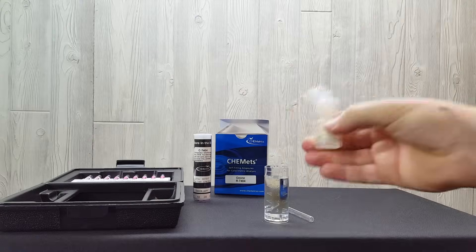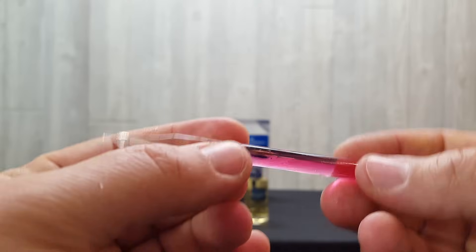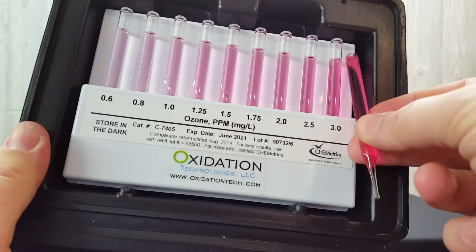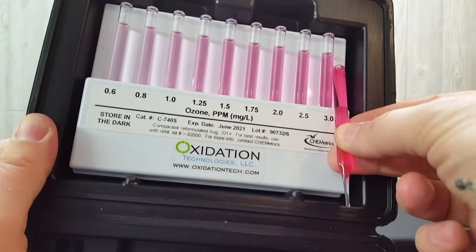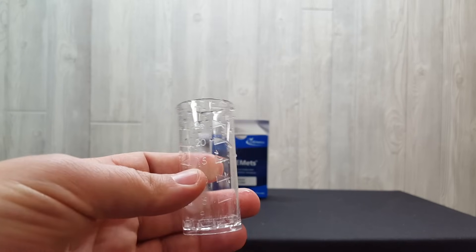Our previous videos show what's included in the K7404 Dissolved Ozone Kit and how to measure dissolved ozone using this kit's standard measuring range of 0.05 parts per million to 3 parts per million. However, if your dissolved ozone levels are higher than 3 parts per million, resulting in a darker pink test result than the 3 parts per million vial included in this kit, you can use dilution to test higher levels of dissolved ozone.